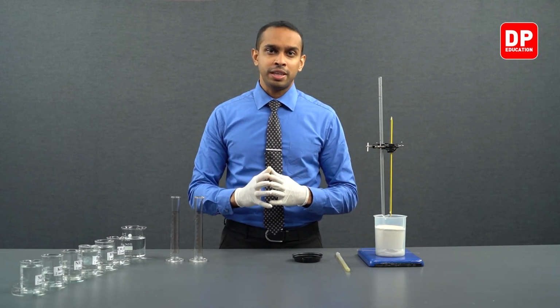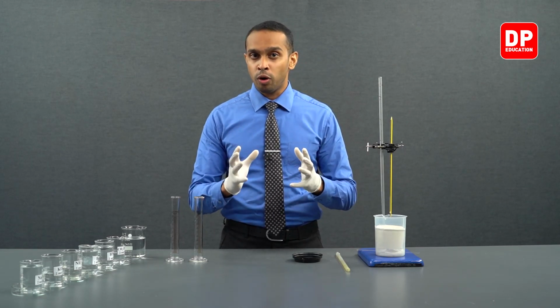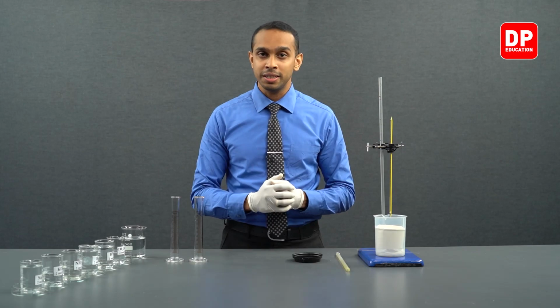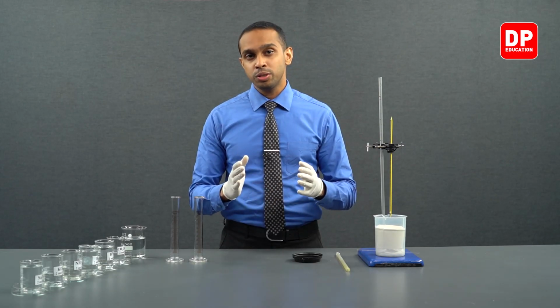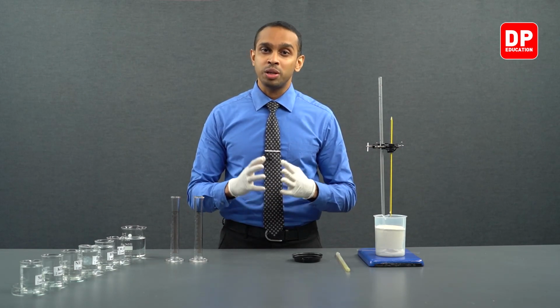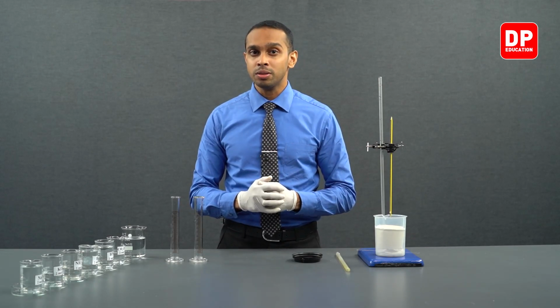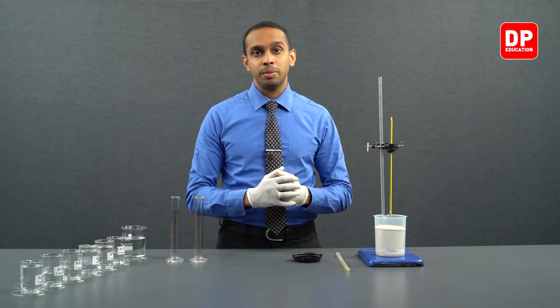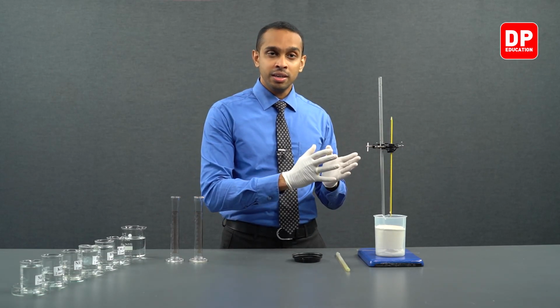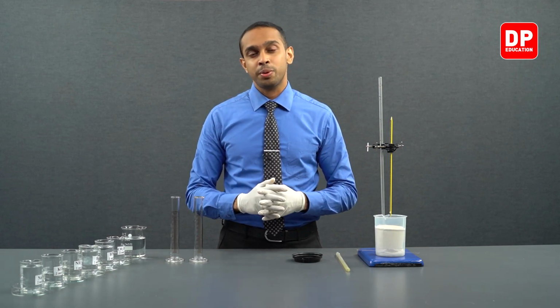Due to the fact that we know the volume of the solutions we are using, we know the overall volume of the reaction mixture. Thereby, we know the overall volume of water that we are using here. And with the use of the temperature increase we can calculate the amount of heat that is released from the system. And as we carry this experiment out, we are conducting this experiment at atmospheric pressure conditions. So we assume that we subject this reaction mixture to a constant atmospheric pressure condition.